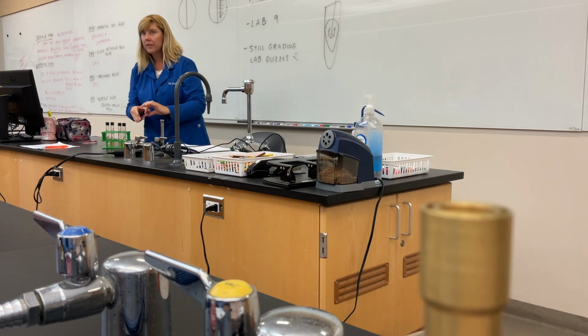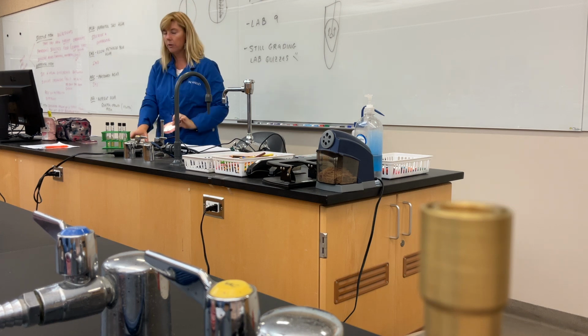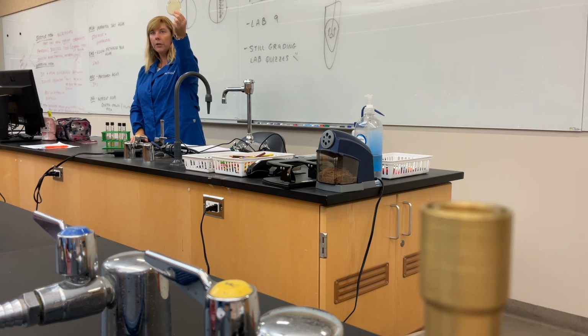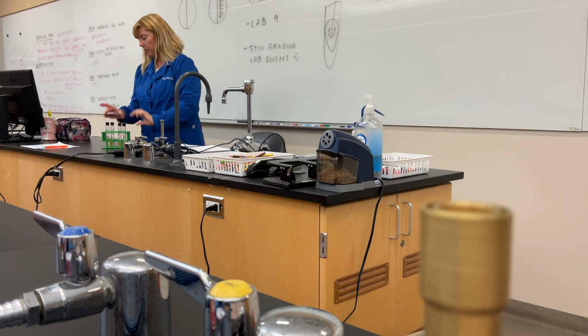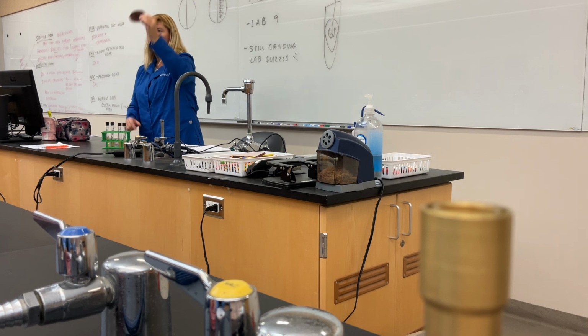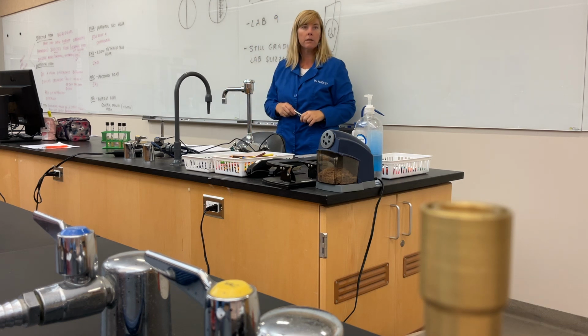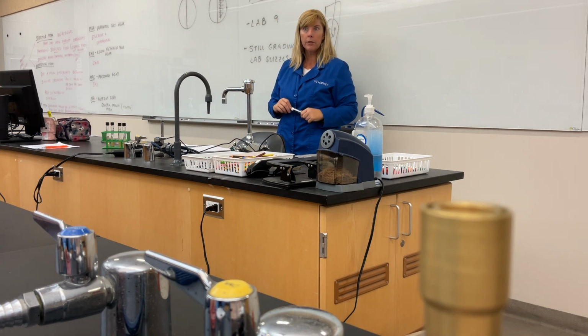So all of us are going to be setting up one mannitol salt agar with 2 organisms. You and your lab partner set up 2. One nutrient agar with those same 2 organisms. One MacConkey agar. And then one EMB, all right, with those same 2 organisms. So whichever ones you pick, those are yours for the day. All right, everybody got an idea of what we're doing?